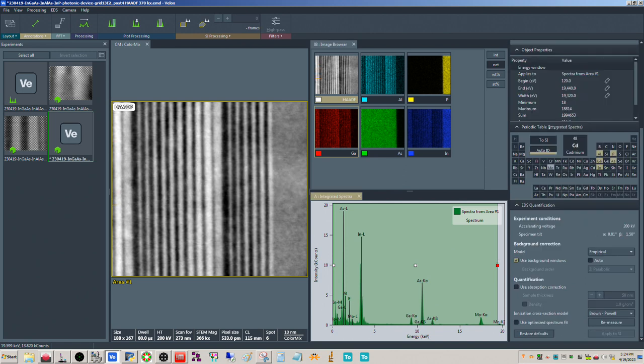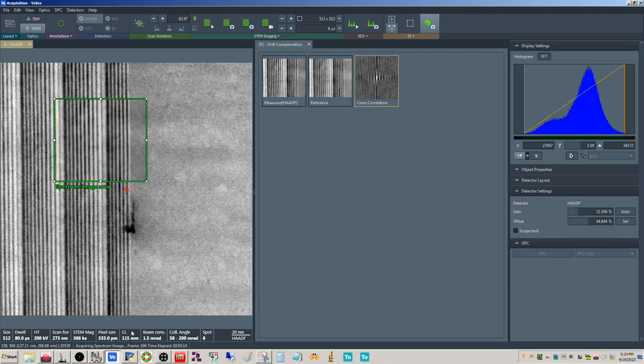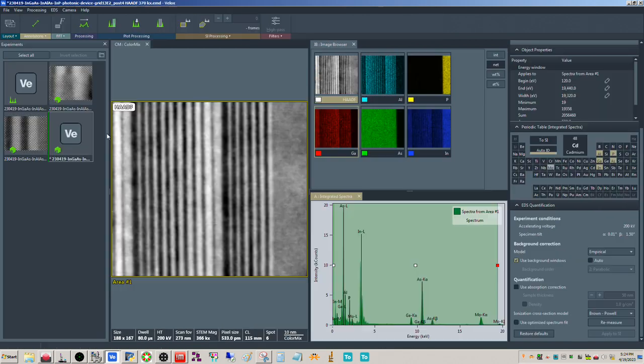All right, so what do we got here? We have almost 2,000,000 counts in about a third of the time. Really no damage. When the probe is bigger like this, you're not causing as much damage as you get with the angstrom level probes with the high current, right? Because your current density is not as high anymore. So another advantage to microprobe is just sample damage. You just don't have the same issue that you do with the atomic level.